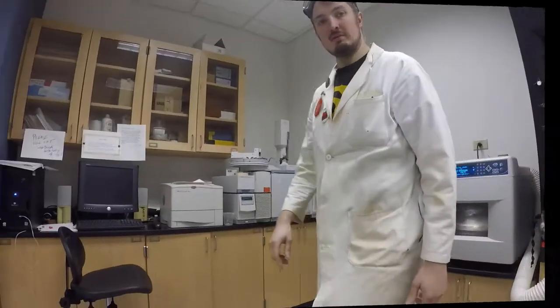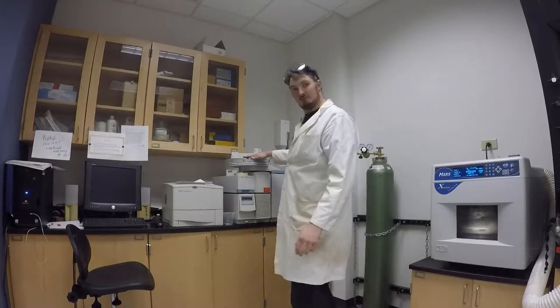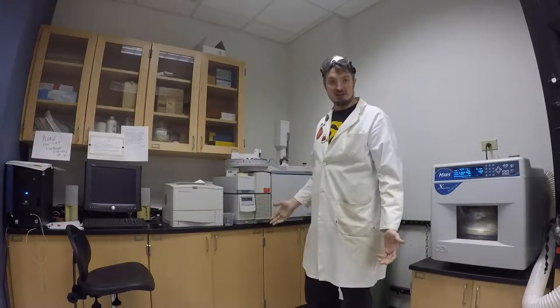Hi there, folks. Today we're going to learn about how to set up your sequences for auto sampling using GC-MS. Let's have a look. So here we are at the GC-MS. We have a bunch of samples loaded up, ready to go here. I'm going to show you how to get these things set up.